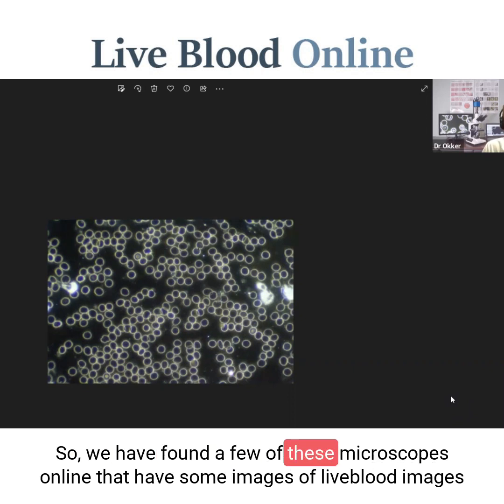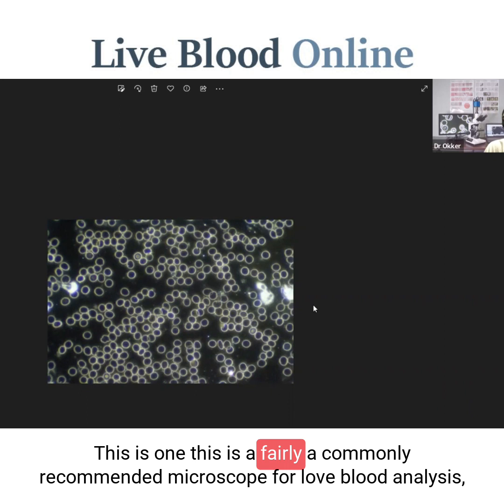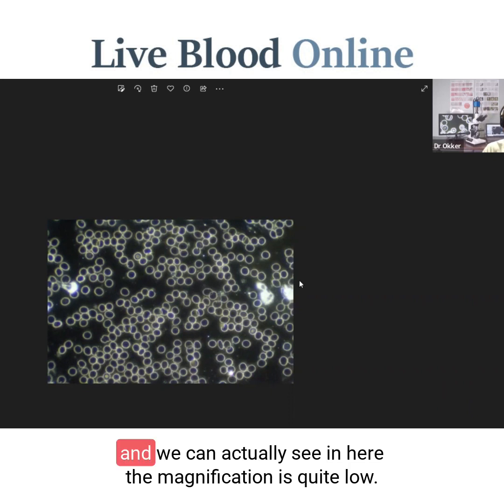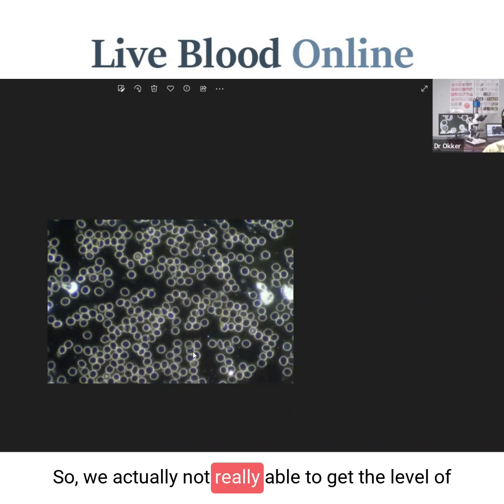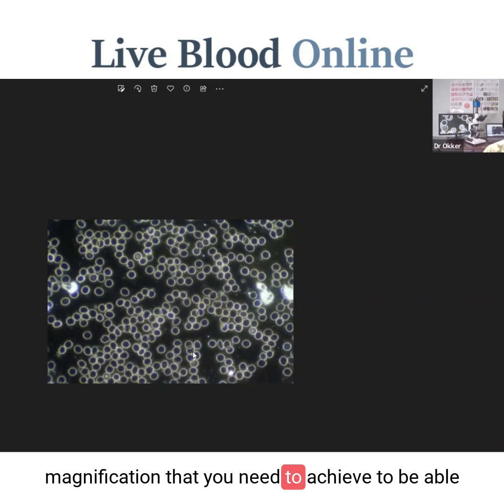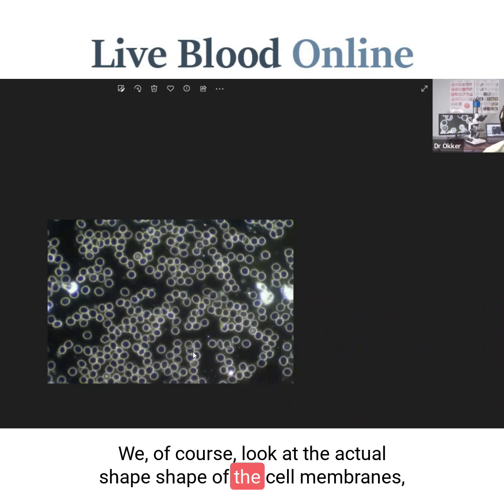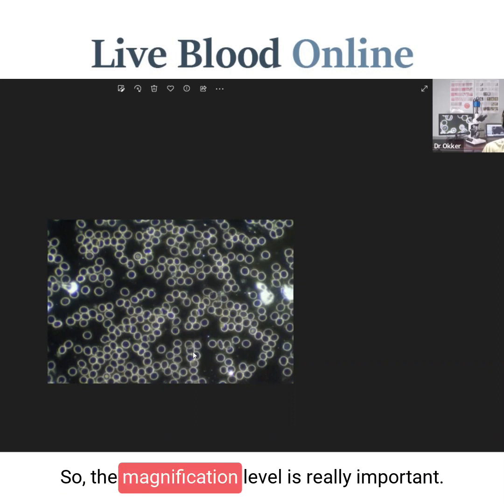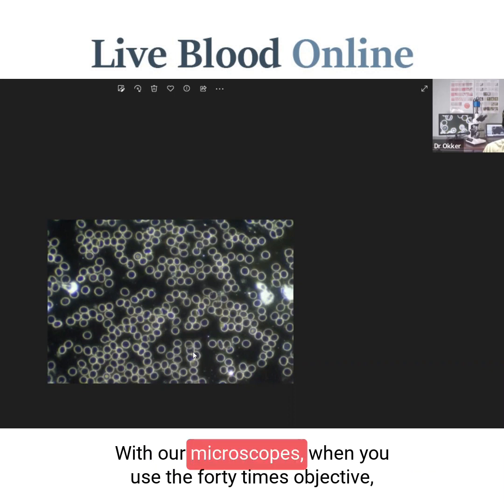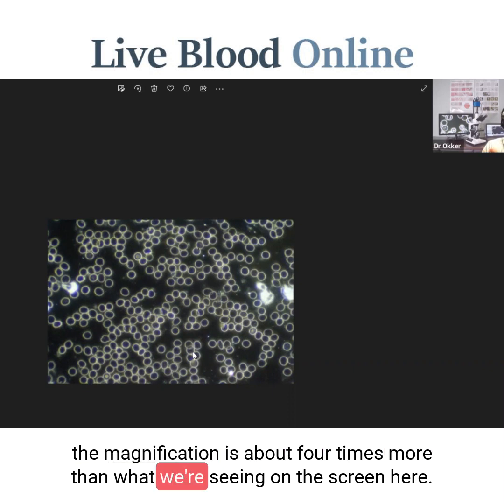We found a few of these microscopes online that have images of live blood samples. This first one is a commonly recommended microscope for live blood analysis. We can see the magnification is quite low — we're not really able to get the level of magnification needed to properly look at the shapes of the red blood cells, the cell membranes, or structures within the red blood cells. This is a fairly inexpensive dark field microscope sold online, and we can see the outlines of the red blood cells, some white blood cells, and some structures that might be thrombocytes, but really not much detail.